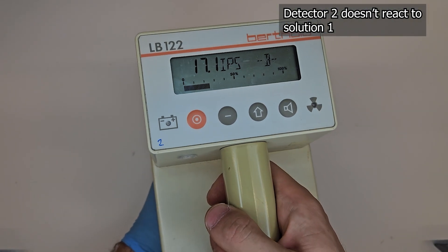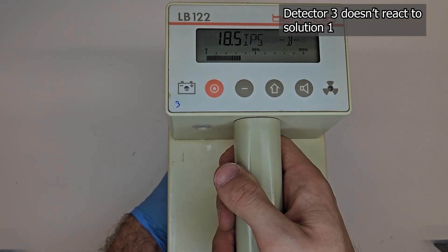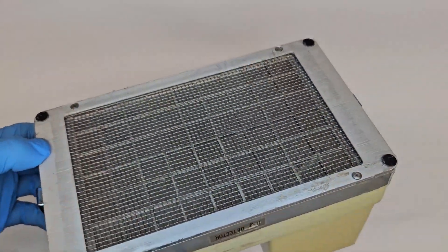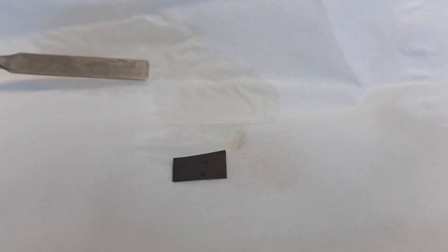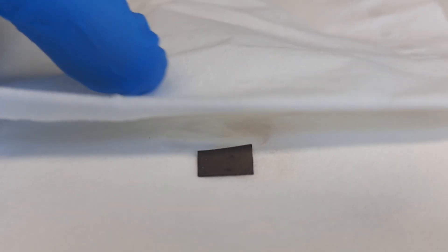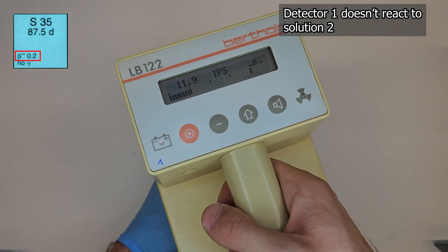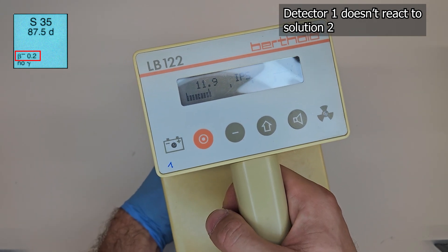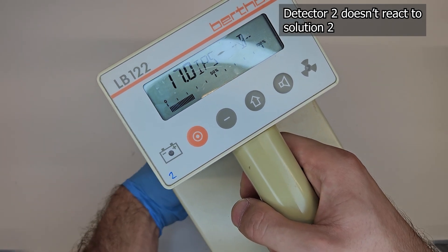Are our detectors suitable for measuring sulfur-35 contamination? I mean, why wouldn't they? We cover our contamination monitors with cling film — this often gets remarked upon: "Why do you do that? You can't measure alphas now." Yes, that's completely true, but we also never work with pure alpha emitters. Sulfur-35 is a low-energy beta emitter used only in our practical course. When we test it, we can see that the weak sulfur-35 solution really can't be measured that well. That's problematic because most contamination involves a single drop, not spilling the whole stock solution.